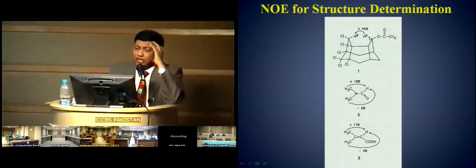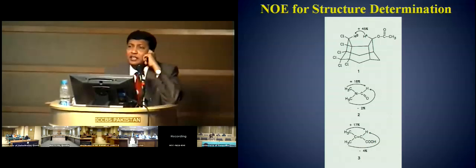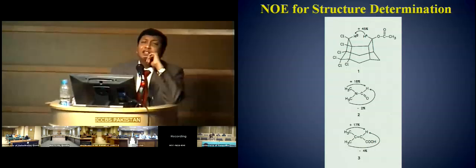So this is an NOE, and 45% of NOE, when you irradiate proton A, you see a 45% increase in the intensity of B. So it's a 45% NOE.